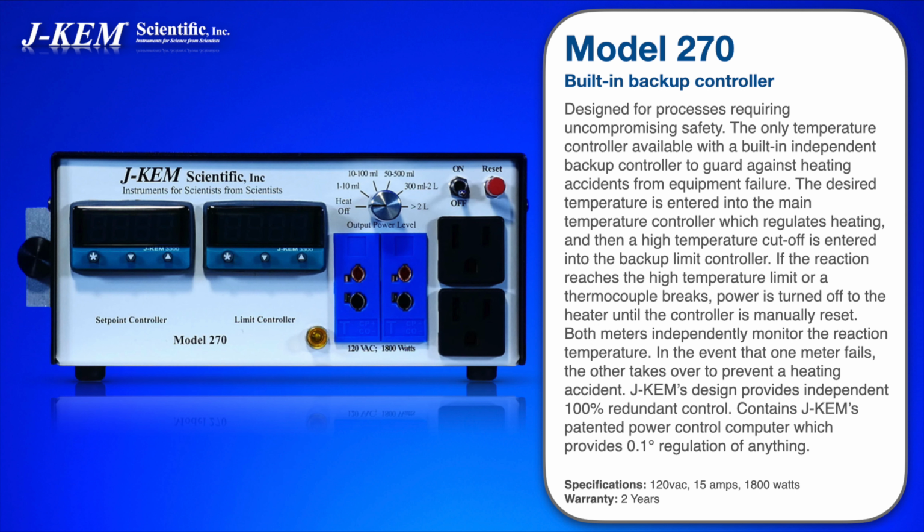So when you set up a reaction, just like a normal controller in the set point meter, you'd enter the desired temperature. In the safety controller, the backup controller, you'd enter what you consider your high temperature cutoff to be. And now you have both the primary temperature controller and an independent backup controller watching the exact same reaction. And if at any point they disagree, if they disagree on what the set point is, or if one of the 2 controllers' thermocouples go bad, if they disagree at any point in that heating process, both of those controllers have the power to shut that reaction down and keep it off until you manually reset the controller.